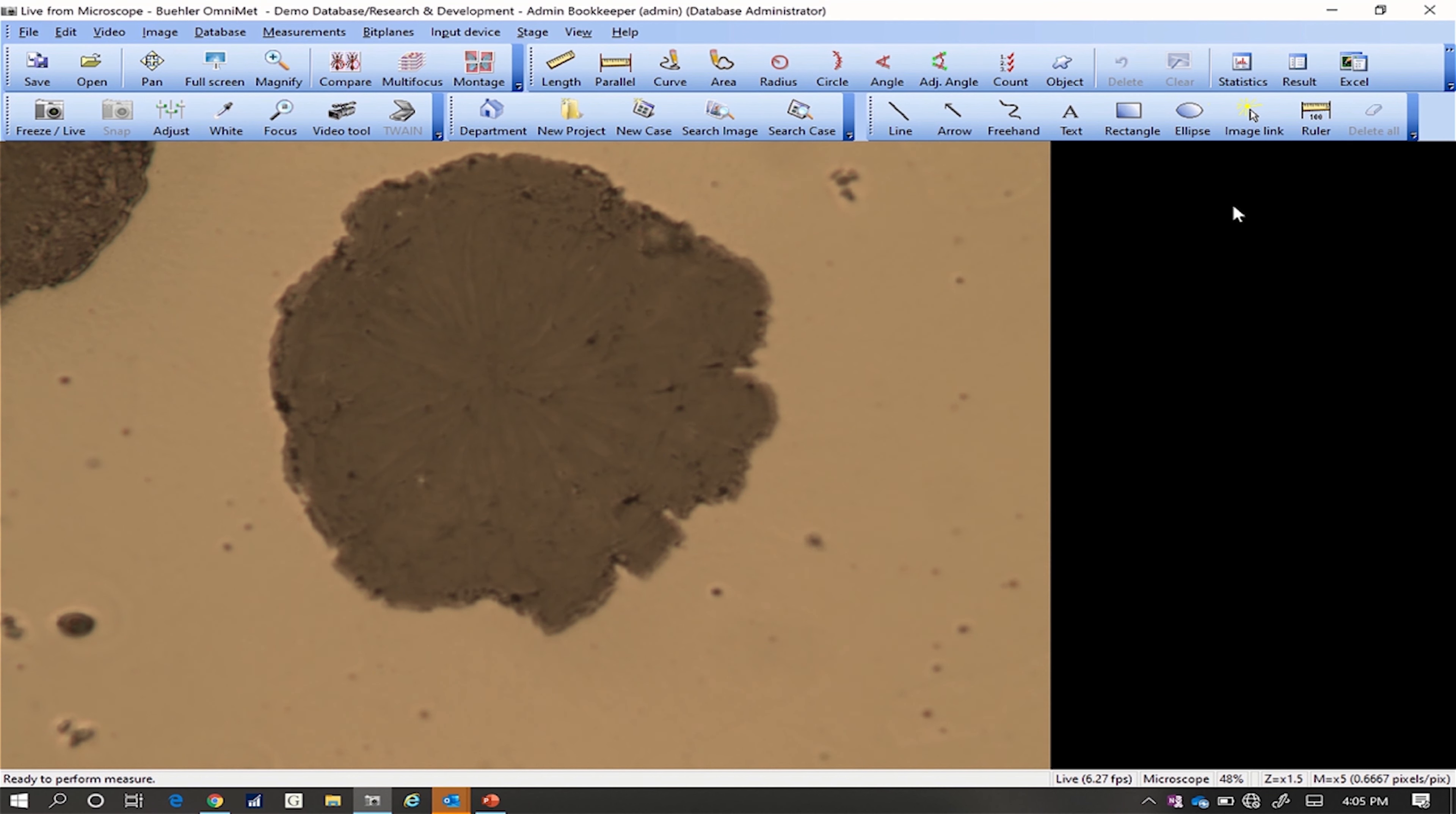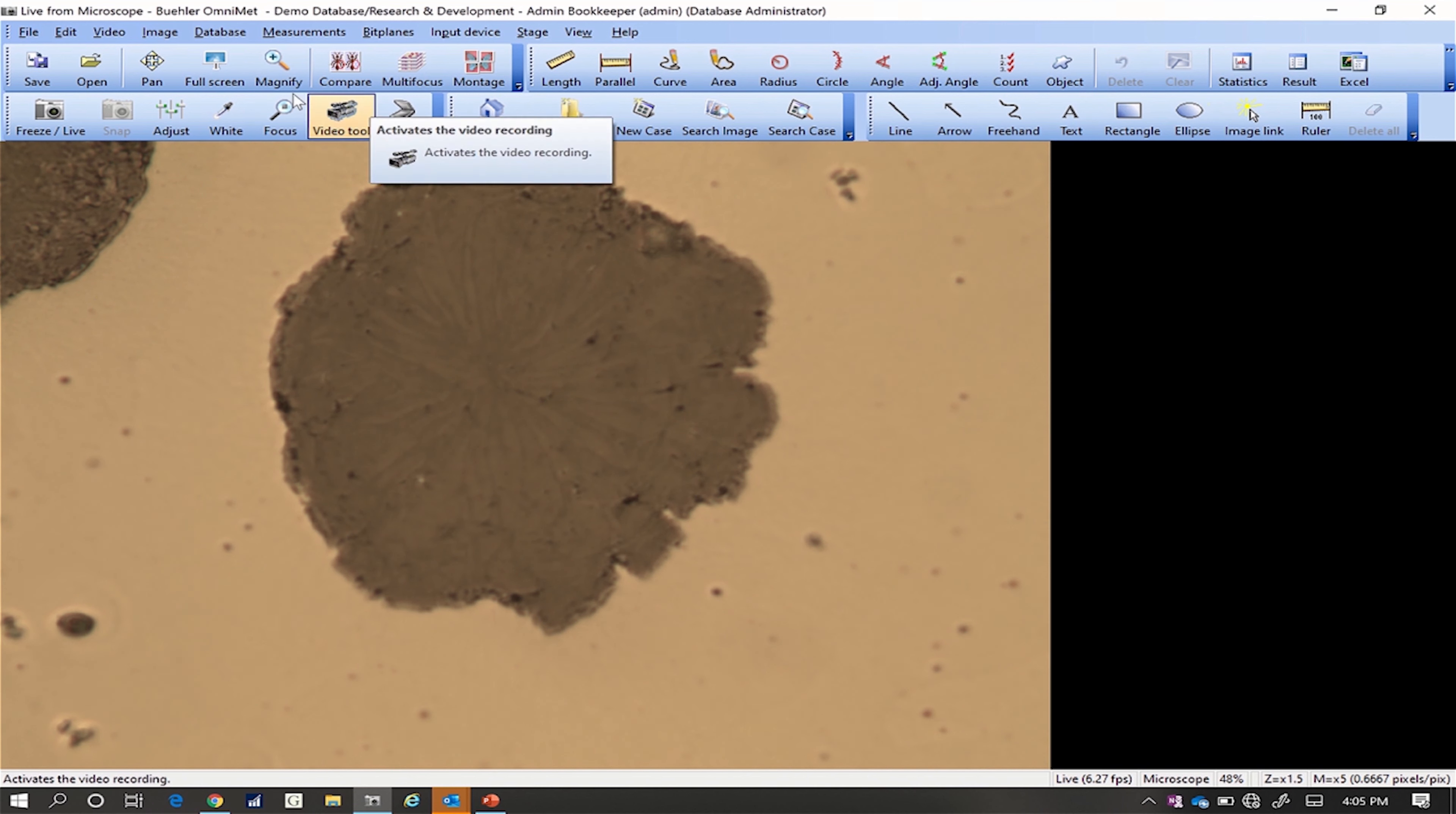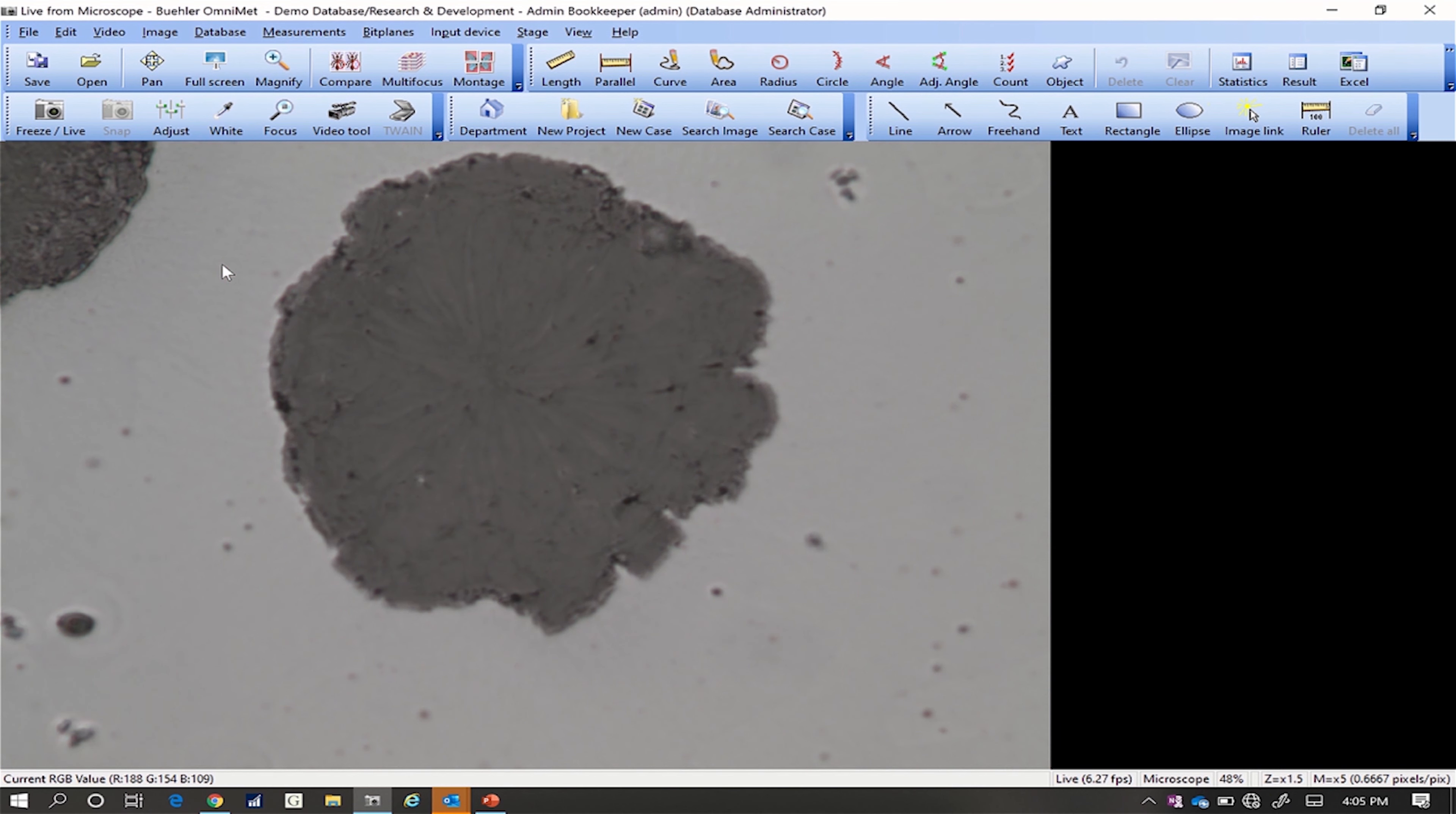First, ensure the camera image is well lit and that white areas are not over-illuminated. Select the White tool from the camera toolbar or under the Video menu, select Auto White. Click on an area of the image known to be white. All colors in the image will be shifted to their correct color.